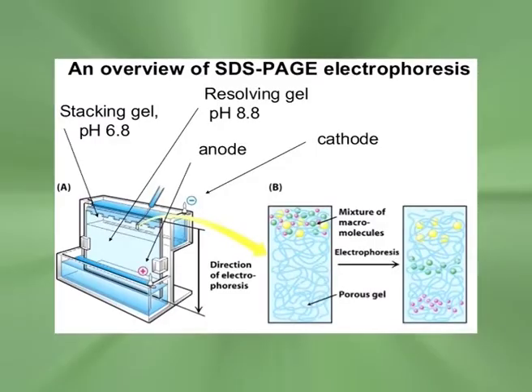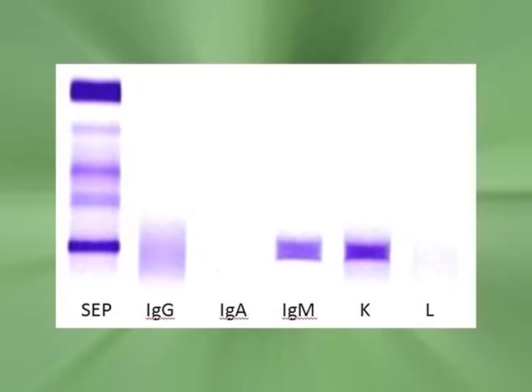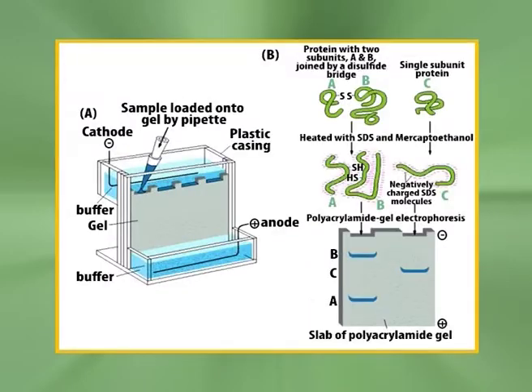One of the most commonly used among these procedures is sodium dodecyl sulfate polyacrylamide gel electrophoresis (SDS-PAGE). It is the most common means of analyzing proteins by electrophoresis. SDS is a detergent which denatures proteins by binding to the hydrophobic regions and essentially coating the linear protein sequence with a set of SDS molecules.